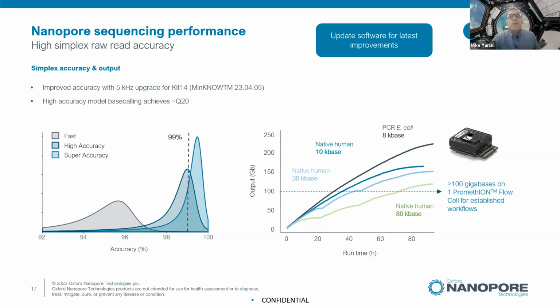And so if you shear the DNA, say like 10 KB, you can walk away. And this is also similar to Anne's metagenomic samples. A lot of metagenomic extractions are somewhere between 5 and 10 KB. You could usually walk away from those flow cells with no interactions. But if you want longer read length, say 30 KB, where you want to phase the genome like a human-sized genome, you can fragment it to 30 KB and then just wash and reload every 24 hours or so. And I'll show you some examples of that to maximize the output and also maximize the flexibility with your data analysis.